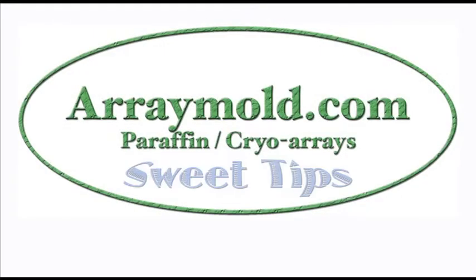Welcome to the Array Mold Sweet Tips video. We made this video to help make tissue microarray construction even easier.